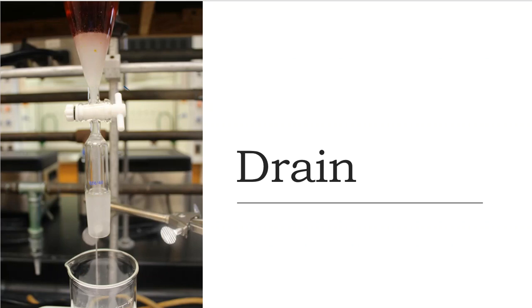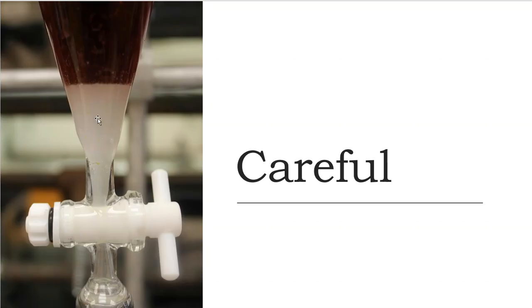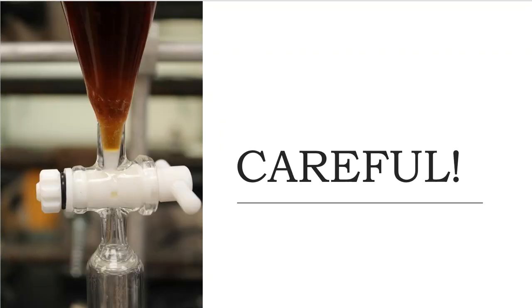So here I've opened up the stopcock on the separatory funnel. I am draining the solutions through. You can actually see it stream down into the beaker that's sitting down below. As I get closer to the stopcock area, be careful, because you want to make sure that you fully separate those two and not get any contamination or crossover or lose product. So as I get closer, careful, you're getting close.